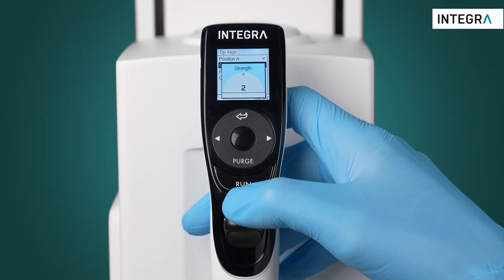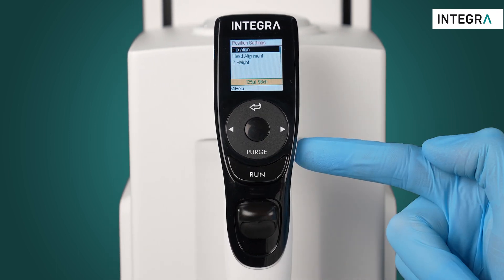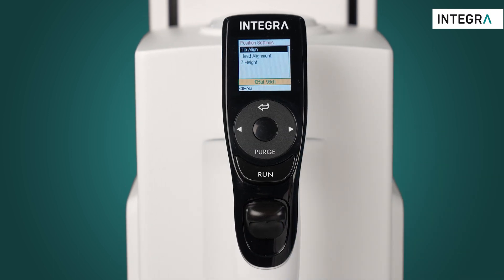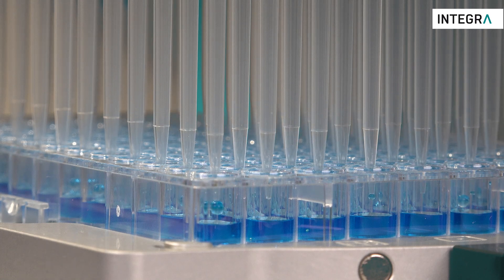Strength two is a useful setting because it will guide you to where you want to go but still allow some freedom to move quickly left or right. This is especially useful for performing tip touch offs. Strength one is similar, just with a weaker guidance.